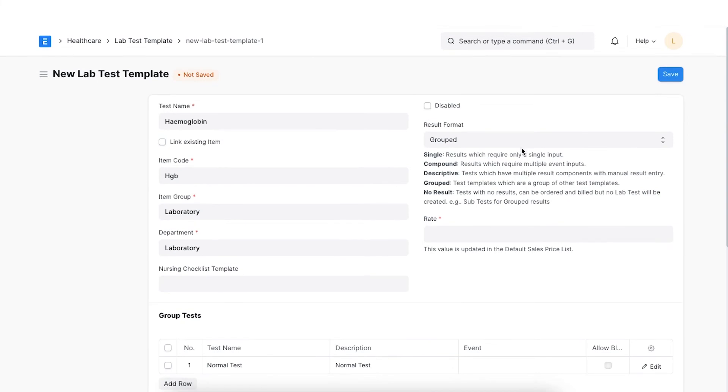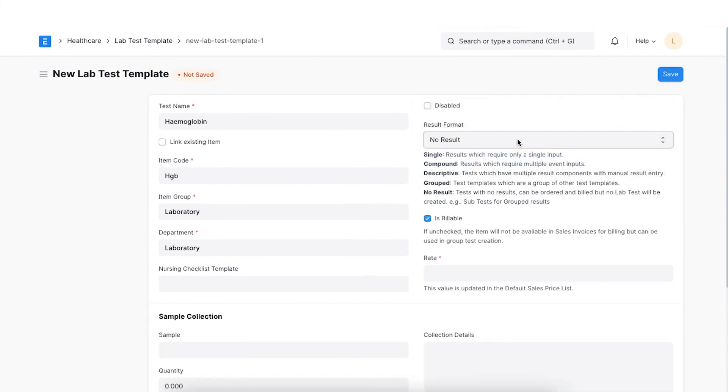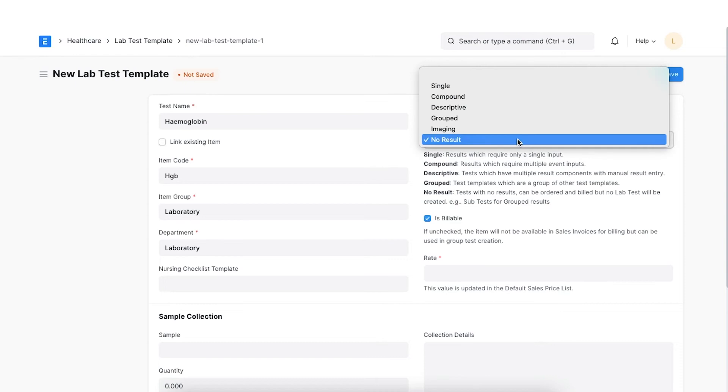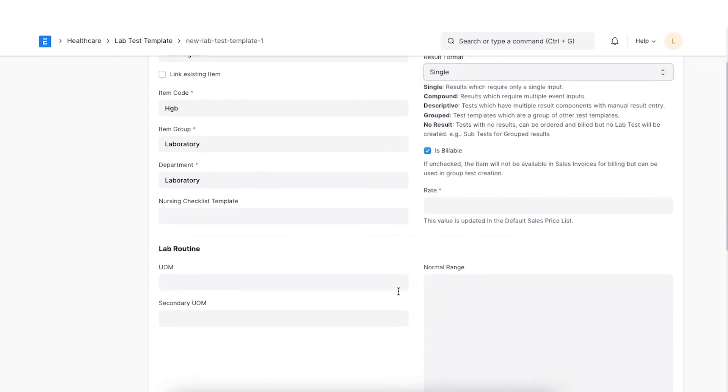Lastly, we have no result. These are the tests that have no result values. Let's select single result format for this example and proceed.